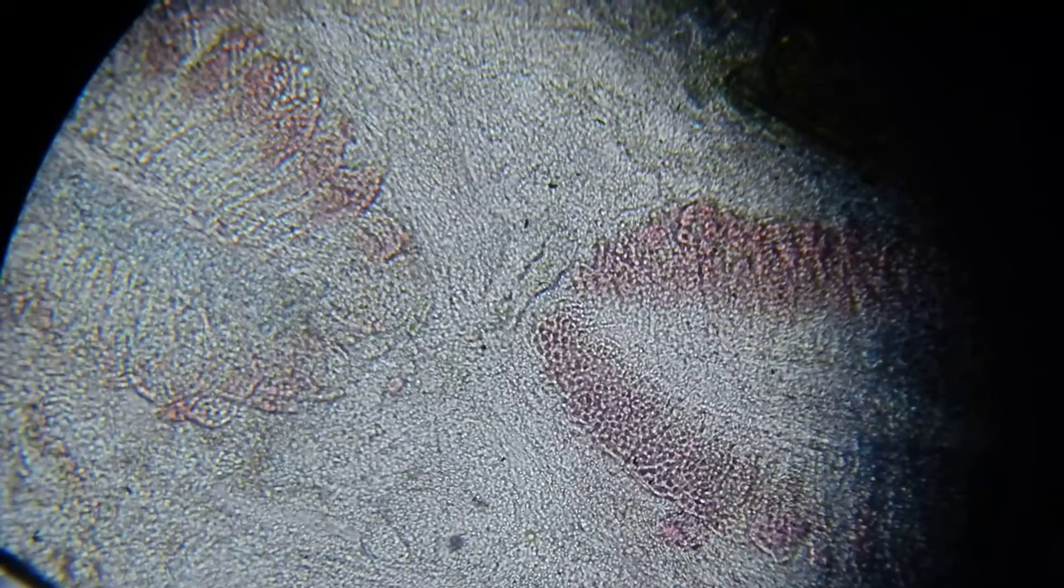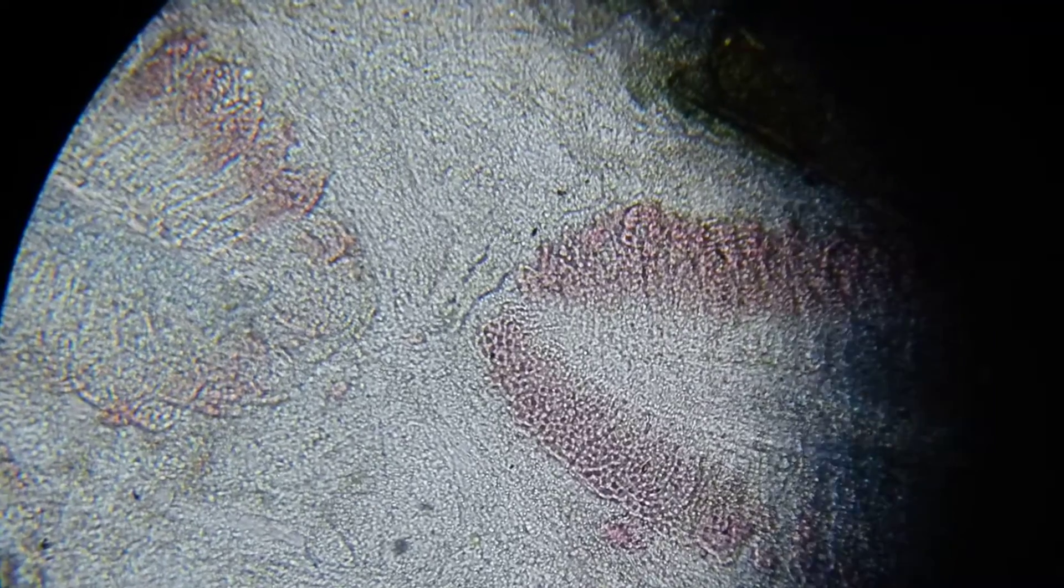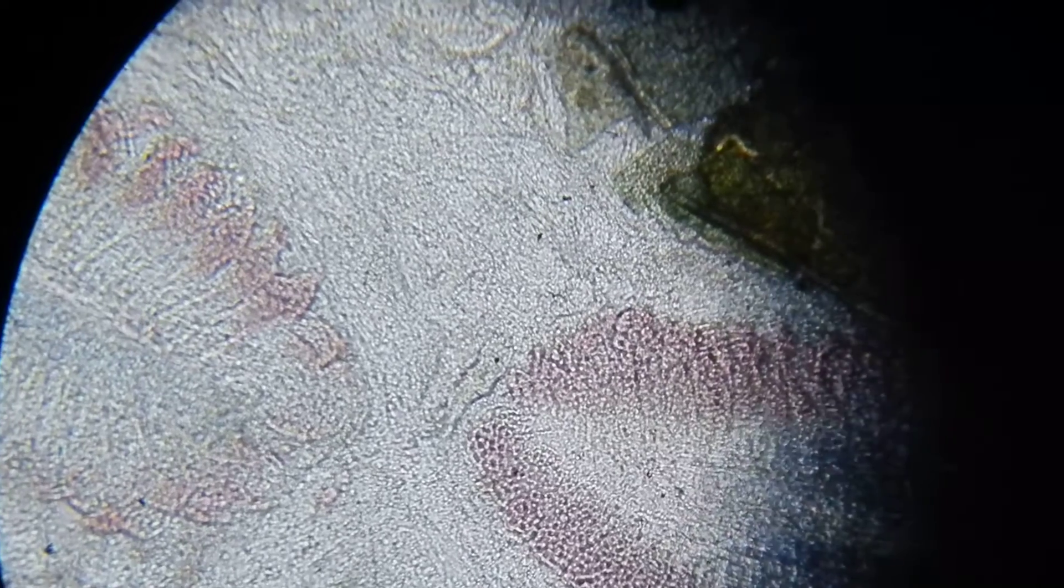It's a bit difficult to tell what sort of fluke that is in the gills. Because you can't quite see whether it's got eye spots. Maybe it doesn't, which puts it into the skin fluke category. However, it's got fairly large haptos. So I'm suspecting that it may, after all, be a skin fluke within the gills of the fish. So yeah, skin fluke and gill flukes might be a bit of a misnomer because you can find either one in either place.